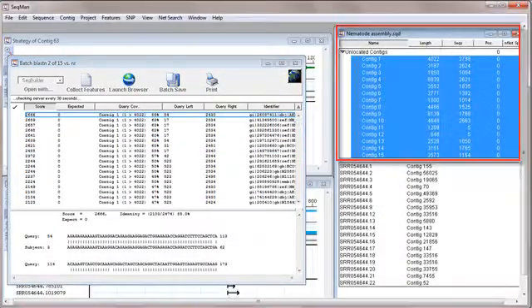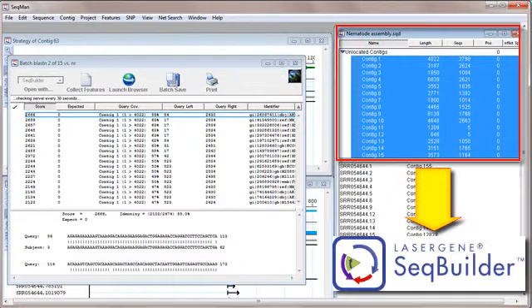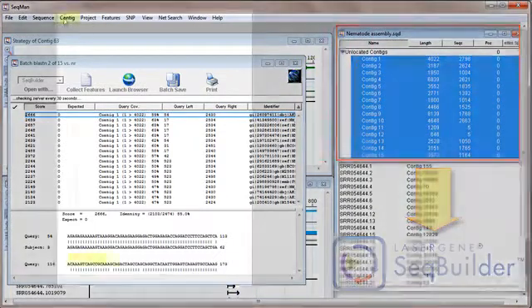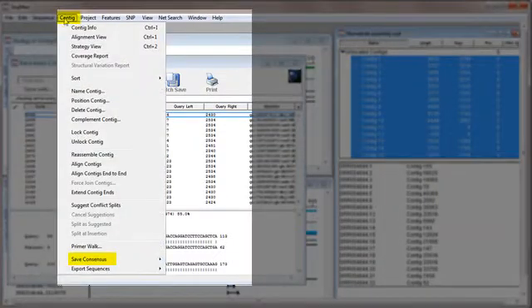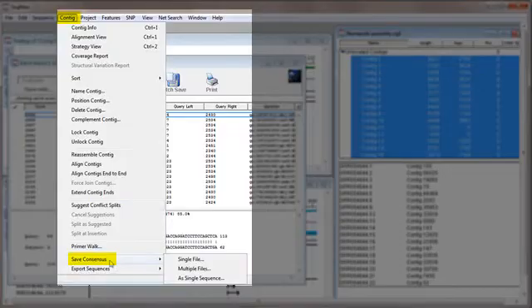Finally, I can export my consensus sequences to SeqBuilder for ORF detection, translation, and annotation.